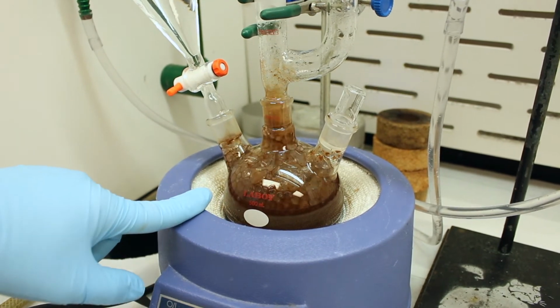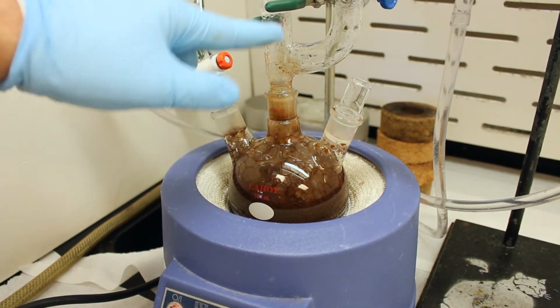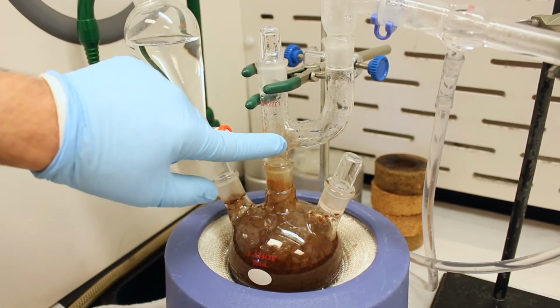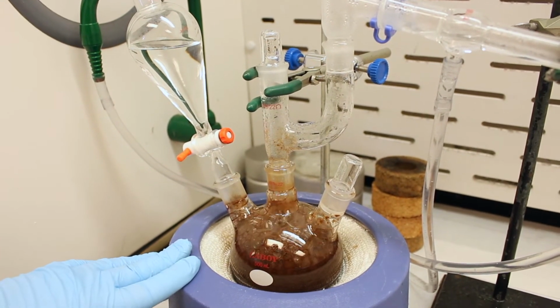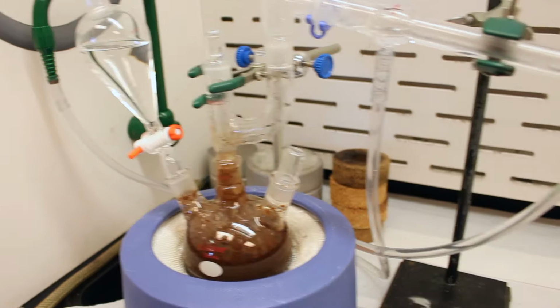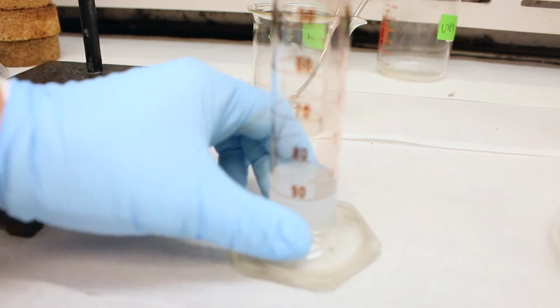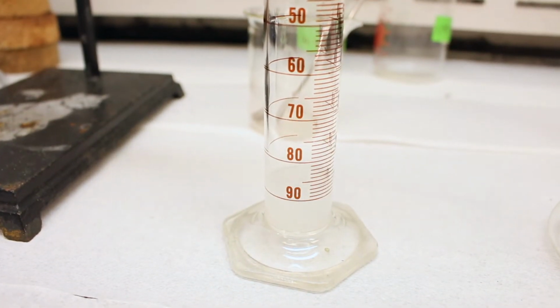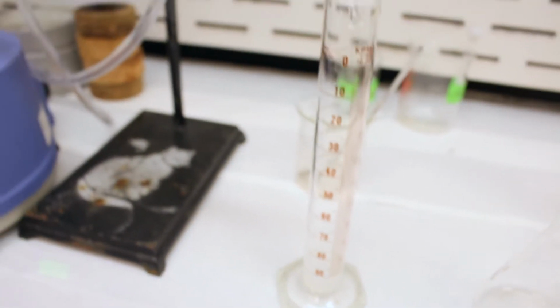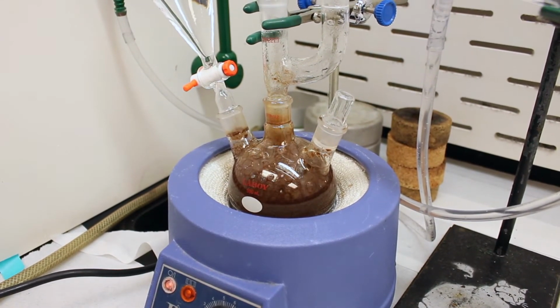Well, you can see that we've heated it and now it's beginning to boil vigorously, and it's threatening to kind of foam up and contaminate our distillate. But thankfully, because we have this extra room from the Claisen head here, we have some breathing room, so hopefully throughout the distillation this bubbling will not climb into the condenser. If you look here, you can see that we're dripping at a somewhat slow pace. So we've collected maybe about 10 mils of distillate thus far, and it's a very milky distillate because, as you know from our pre-lab workshop, the eugenol is immiscible with water, so they do not dissolve in each other, and that's why it's forming the milky appearance.